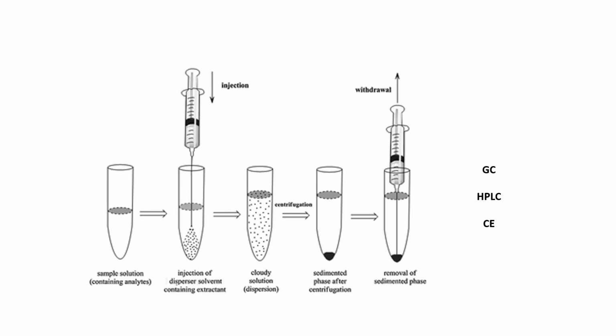So this is the diagram of the DLLME. It contains the sample, and in your sample we will inject the disperser solvent containing the extractant.